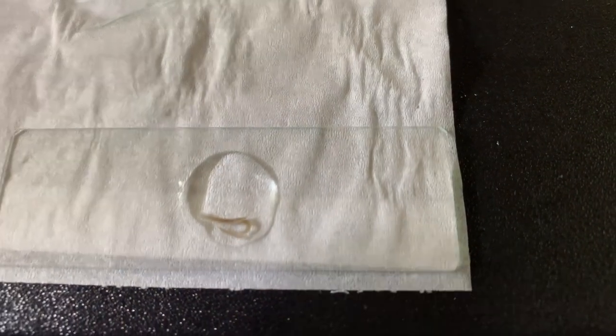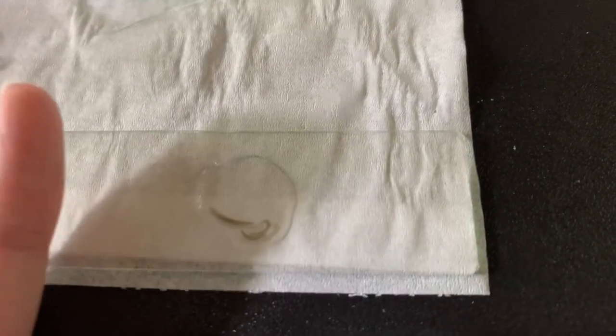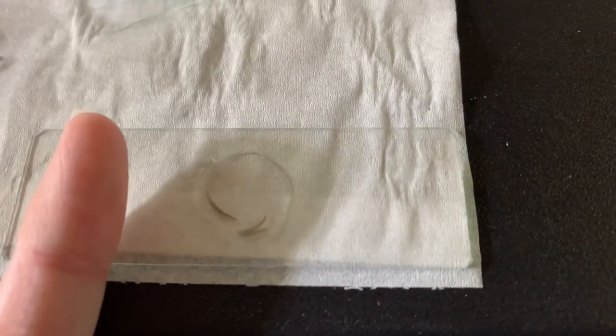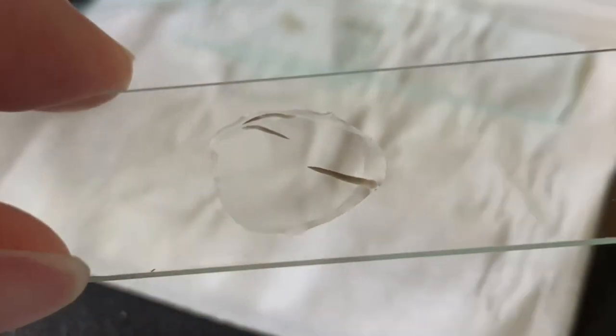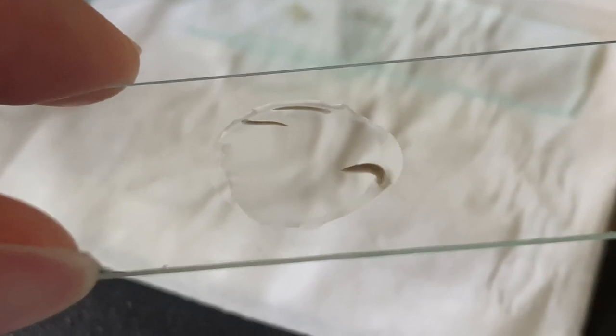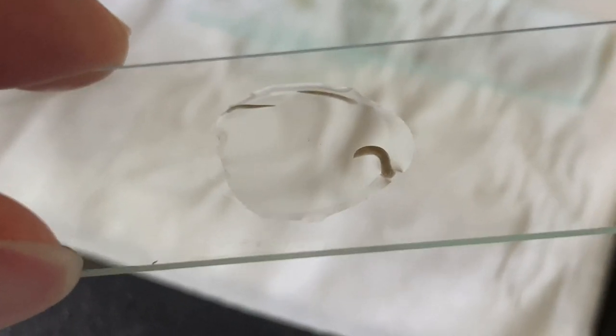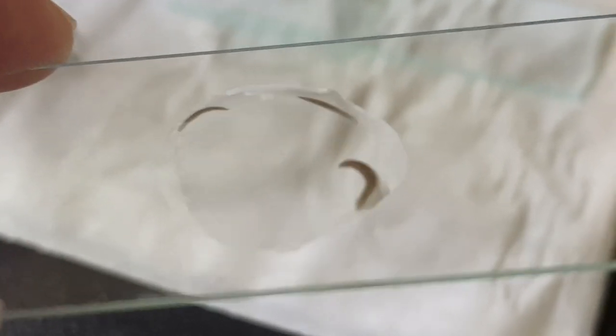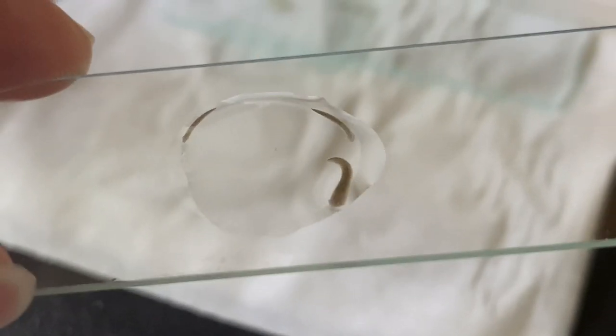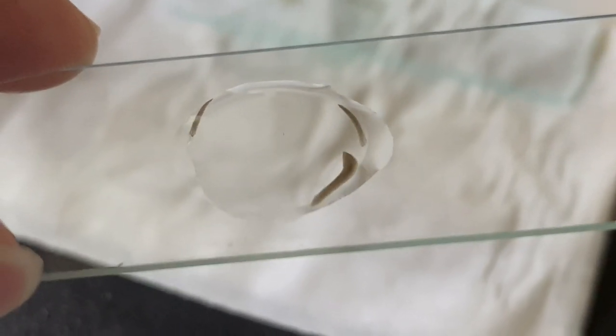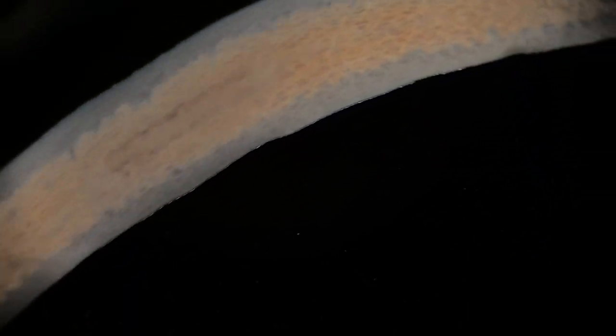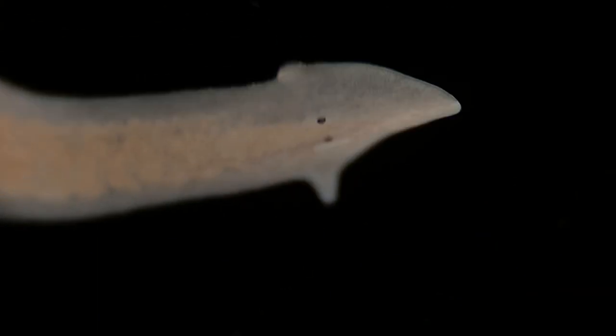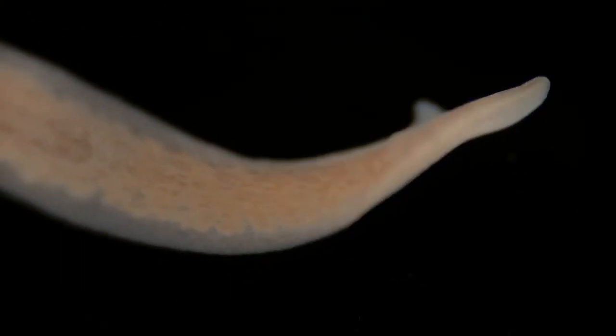Anyway, let's move on and talk about planarians. So these are flatworms and they are very small as you can see. We've got three of them here, and again we're going to be throwing them under and doing a dark field look at them. So here is one of them, and as you can see, they are probably one of the cutest things that you can possibly look at under a microscope.